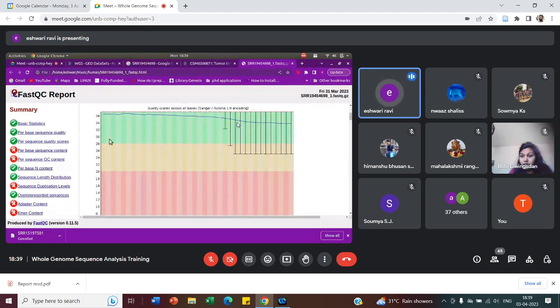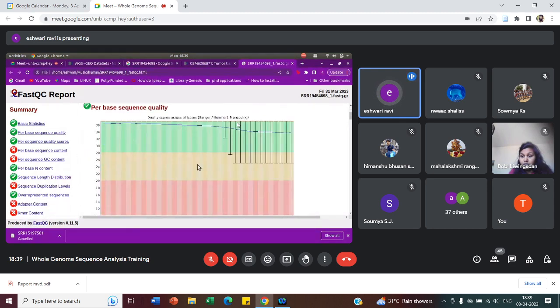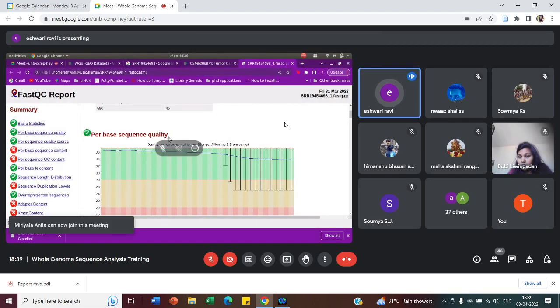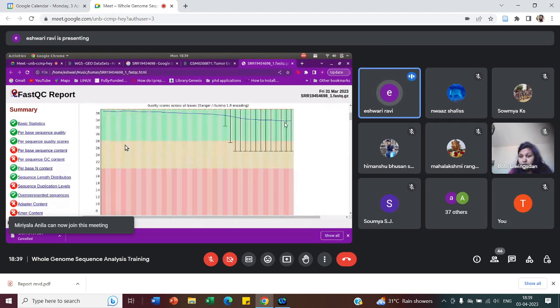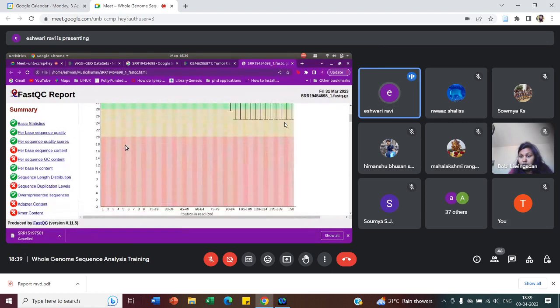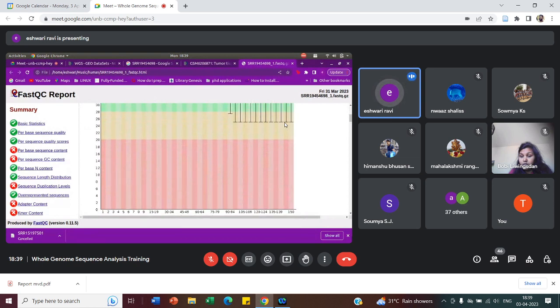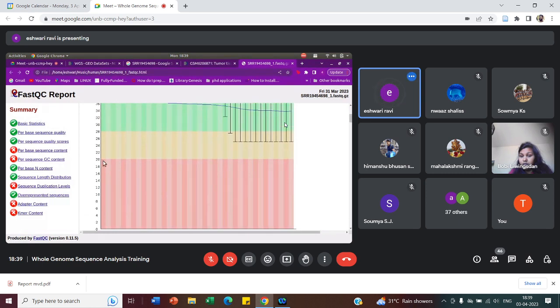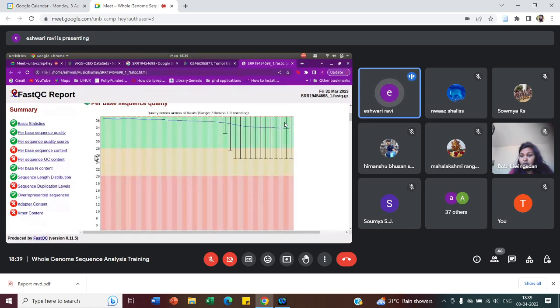The first main important thing to consider is the per-base sequence quality. It checks all the base sequence quality scores and has given us a green tick mark. In the graphical visualization, all reads should be above 30 or 34. We do have some reads around 24 to 26, which may get trimmed when we use Trimmomatic. The blue graph shows all reads at quality scores around 36, meaning all reads belong to a very good quality.